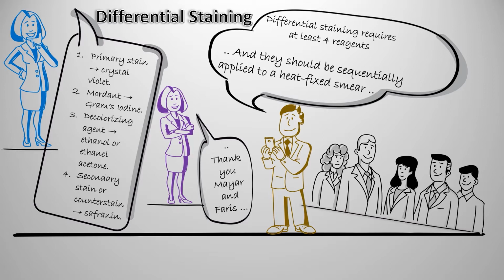It does this by binding the primary stain, forming an insoluble complex called crystal violet iodine complex.